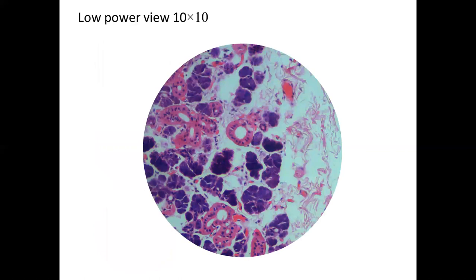This slide shows a low power view (10x) of a salivary gland. At low power, you can visualize a large area at a slightly lower magnification. You can see a blood vessel with squamous cells lining it and red blood cells inside, as well as small capillaries. These are the acini of the salivary gland — a tiny lumen surrounded by darkly purple-stained cells that line the acinus, which is a round structure.